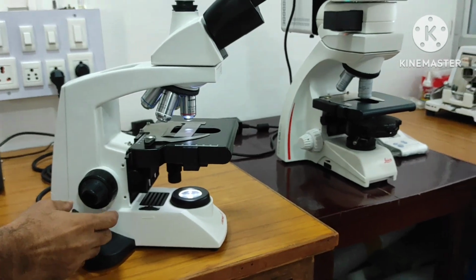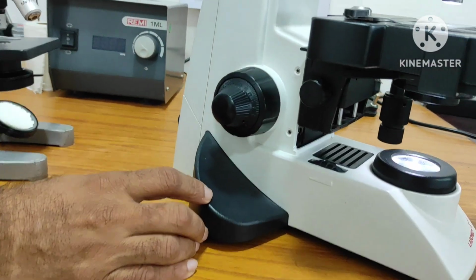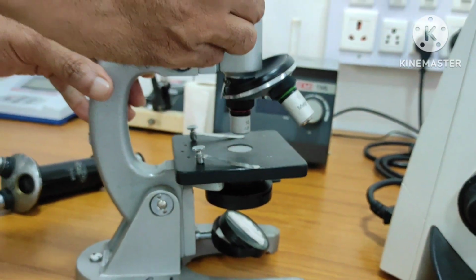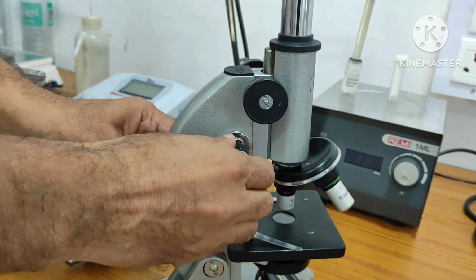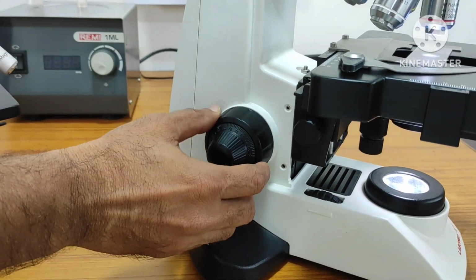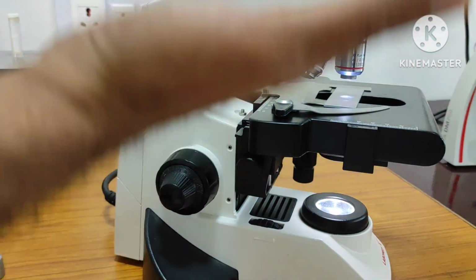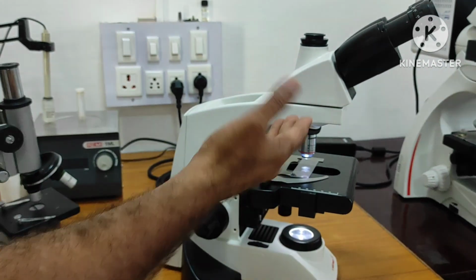Here highly sophisticated types of knobs are present, two knobs. Like in the compound microscope we saw two separate knobs, the coarse adjustment knob and the fine adjustment knob, right? Here also the same things are present together. The outer knob, right, that is for the coarse adjustment. Coarse adjustment means it is adjusting the stage with the objective lens, right?